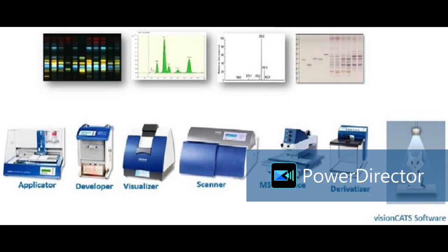Method development involves all these steps and we can validate the HPTLC methods with the latest ICH Q2 R2 guidelines, complete validation. That is possible only in HPTLC, not in TLC, because of lack of reproducibility in TLC. But here we get reproducible results, plate to plate, lab to lab, day to day, analyst to analyst.